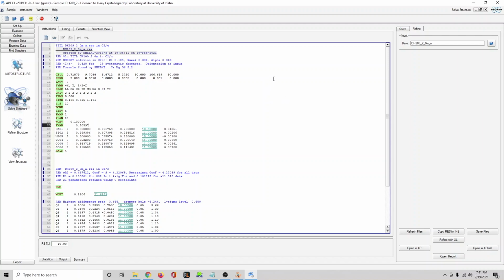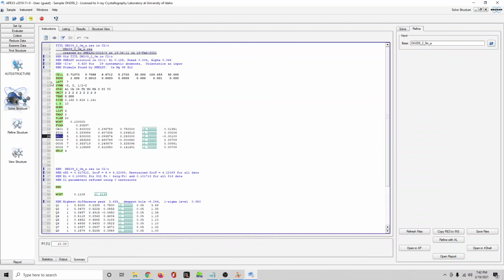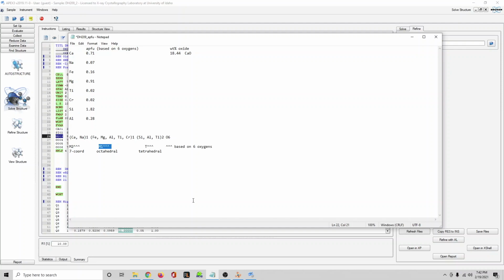All right, so at this stage, I will demonstrate the version of refinement where you just refine the dominant constituents and the ratios of the elements. For example, this pyroxene is calcium, magnesium, iron dominant. Of course, silicon in the tetrahedral site, and those 3 oxygens. These are all correct in their positions and roughly in their occupancy, but the fine details aren't necessarily correct, because this site isn't all magnesium. It's probably 10% of the time or something like that it's going to be iron, and we actually know that from our chemical data, that some percentage of the time the same site is not magnesium. So we have to fit all of this into the structure.